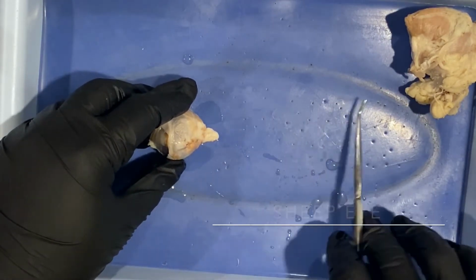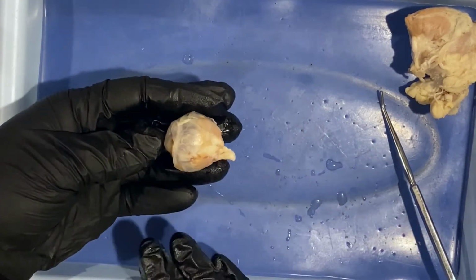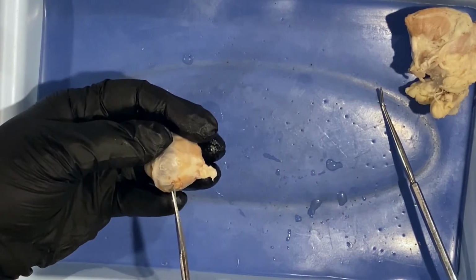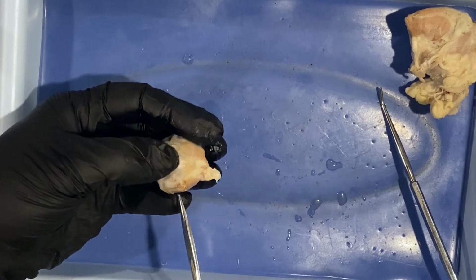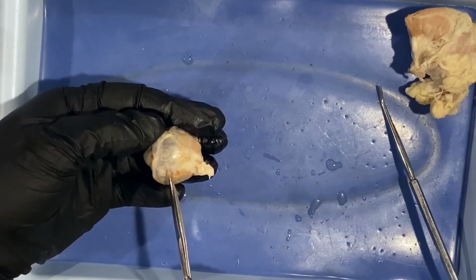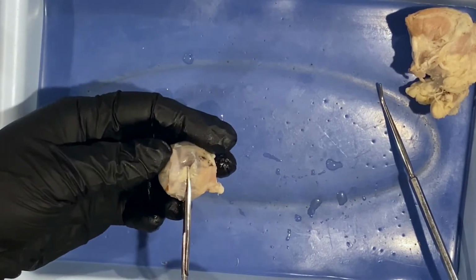So the next portion is we want to actually look at the internal components of the sheep eye. And to do that, I want to separate this into an anterior section and a posterior section. So I'm going to be doing a frontal cut, and to get through the sclera you need a very sharp pair of scissors, or a sharp razor blade, and I'm basically just cutting 1 centimeter behind the cornea.